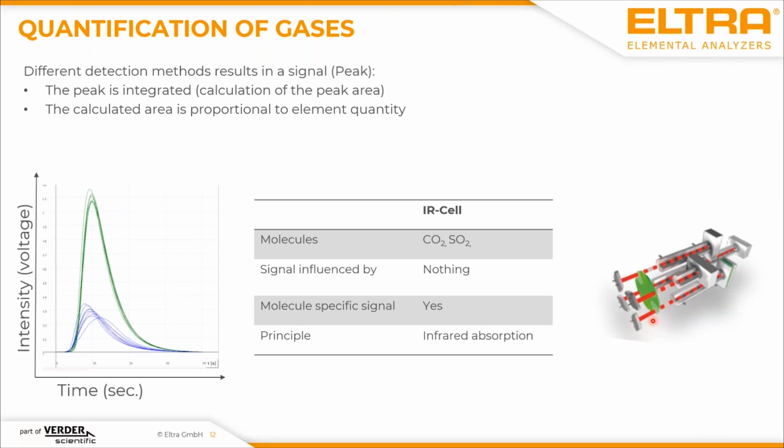This is because we need 2 detectors to cover the whole concentration range, because the length of the measuring cell is part of the physical signal I get later. The longer the length is, the more sensitive my detector is. This is the reason why I need 2 different lengths of detector cells to cover the range from, let's say, 5 ppm to 100%.